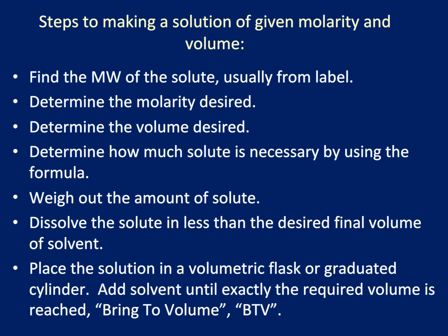Now you've already completed the first few steps in making a buffer. You've found the molecular weight of the solute, you've determined the molarity and the volume desired, and you've determined how much solute is necessary by using the formula in the previous slide. Now it's just a few simple steps before you have the solution.